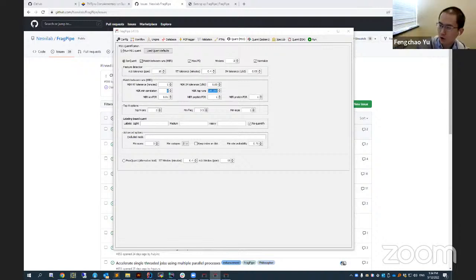Okay, someone asked where is the raw data located? I believe Philip has already answered it, right? If you mean on the web, it depends. You mean on the website or the computer? If it's on the website, you should look for the May Institute program on their website.